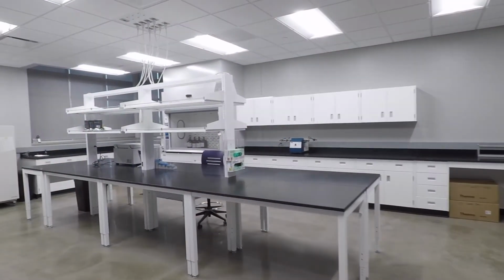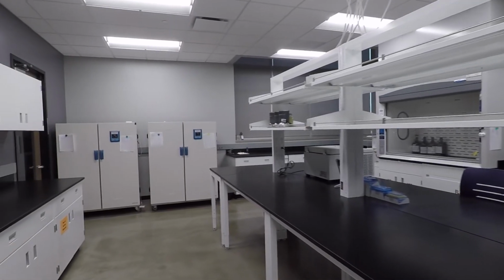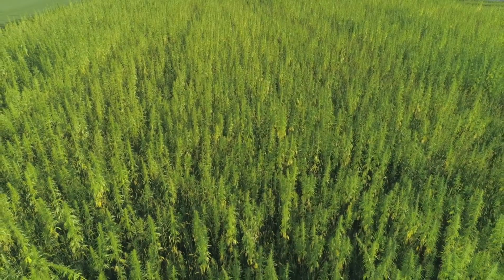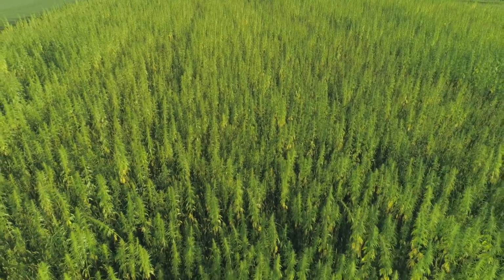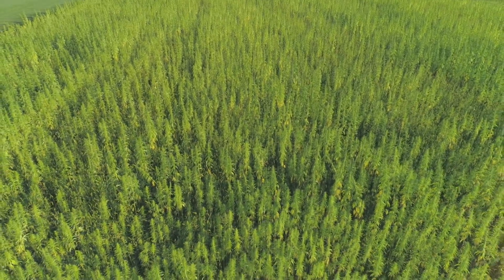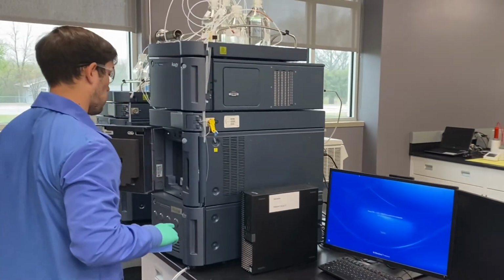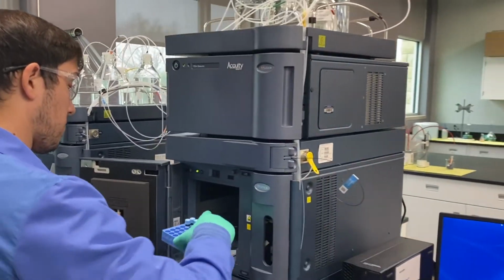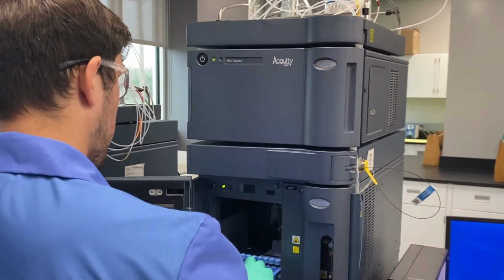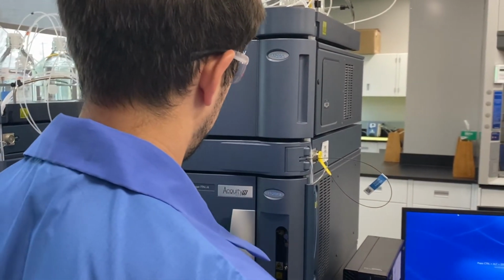The KDA Industrial Hemp Laboratory analyzes hemp samples to ensure compliance with the legal definition of industrial hemp. The lab is busiest in the fall, but receives samples throughout the year. The lab tests the hemp samples to determine whether they contain less than or equal to 0.3% THC, using a method that measures both THC and its acid form.